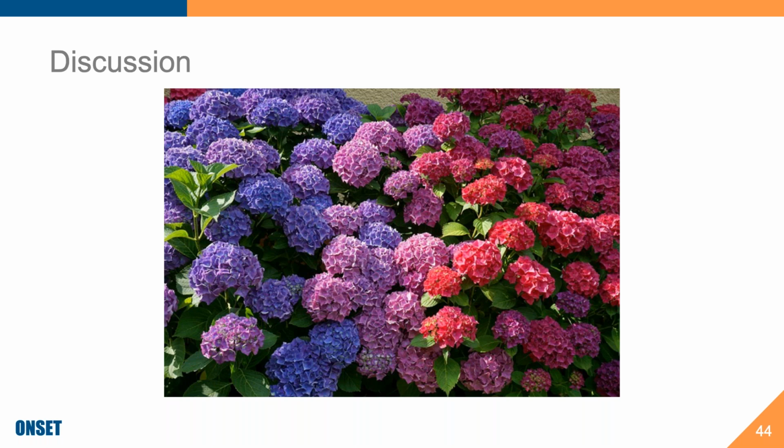So for me, I have it deployed in a river that has a pretty good flow. So I have it every 5 minutes just in case for some reason something happens. I'm actually there. I'm doing a couple of other studies there. So I'm intrigued to see how that pH is being affected by other events.